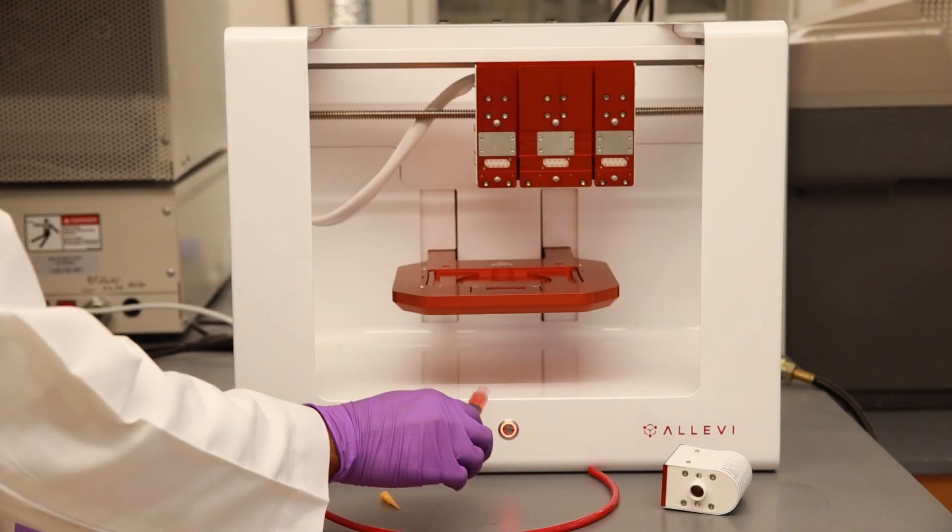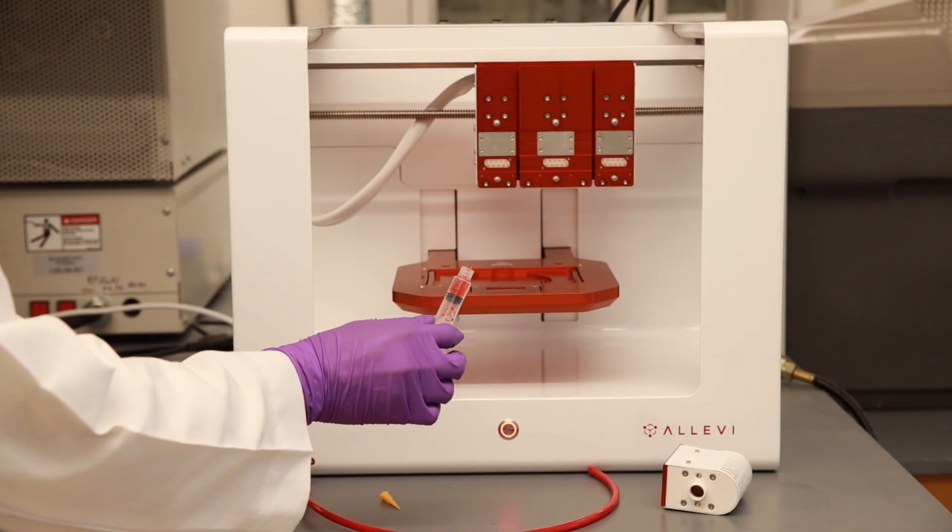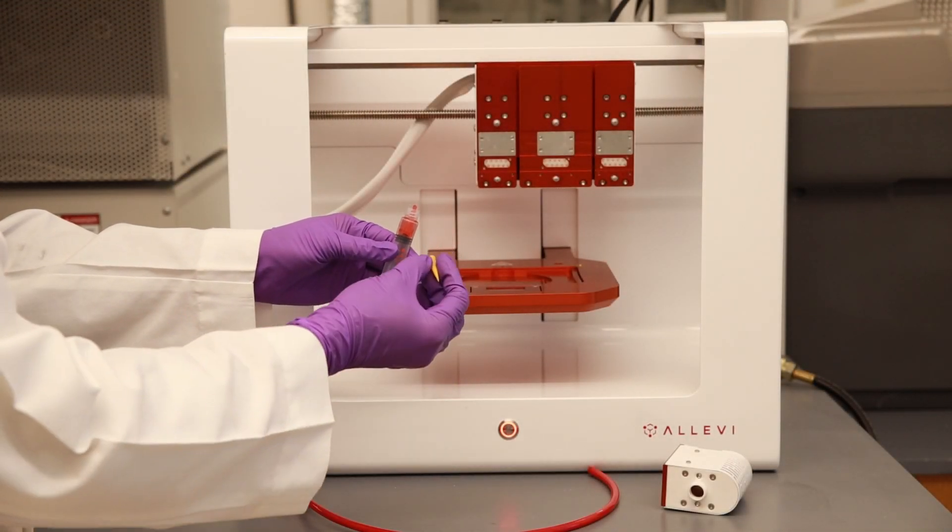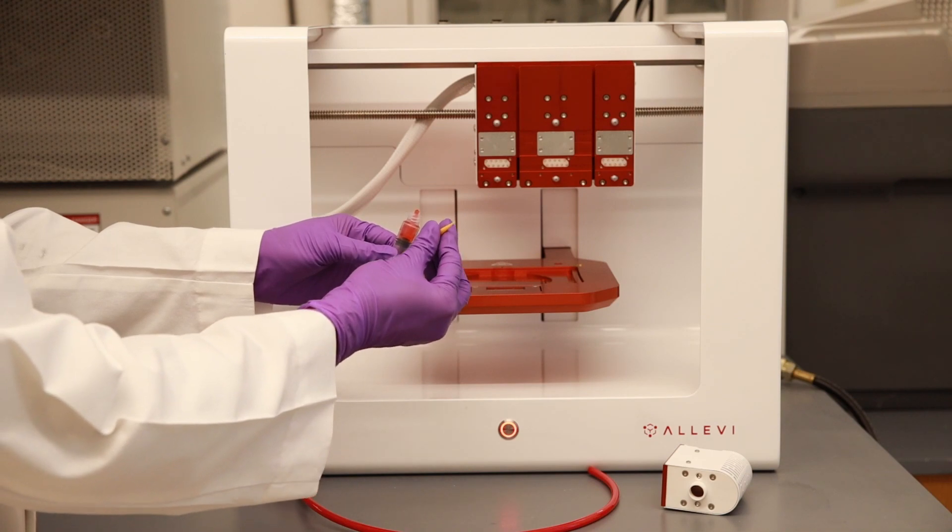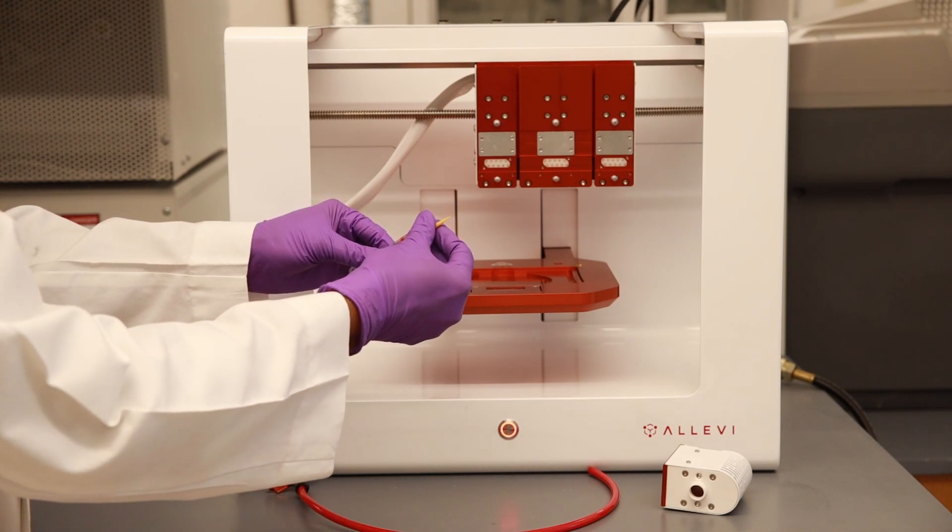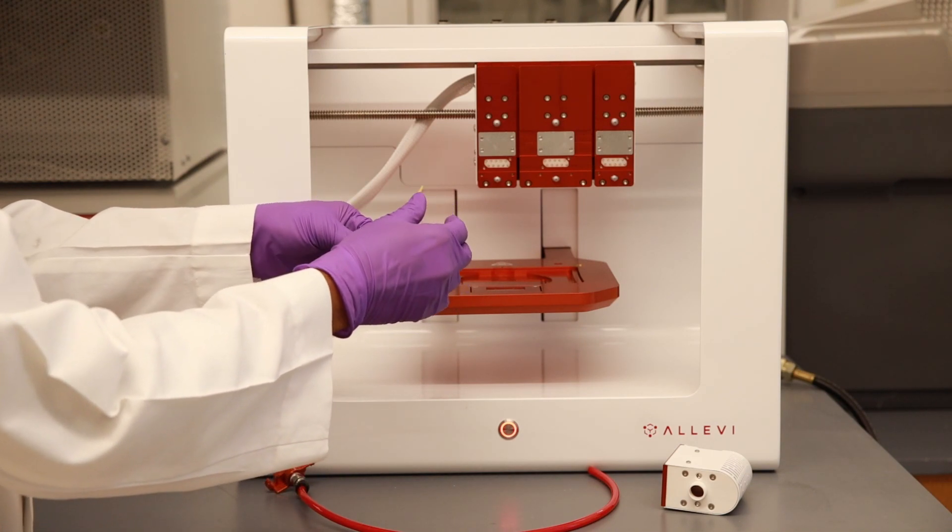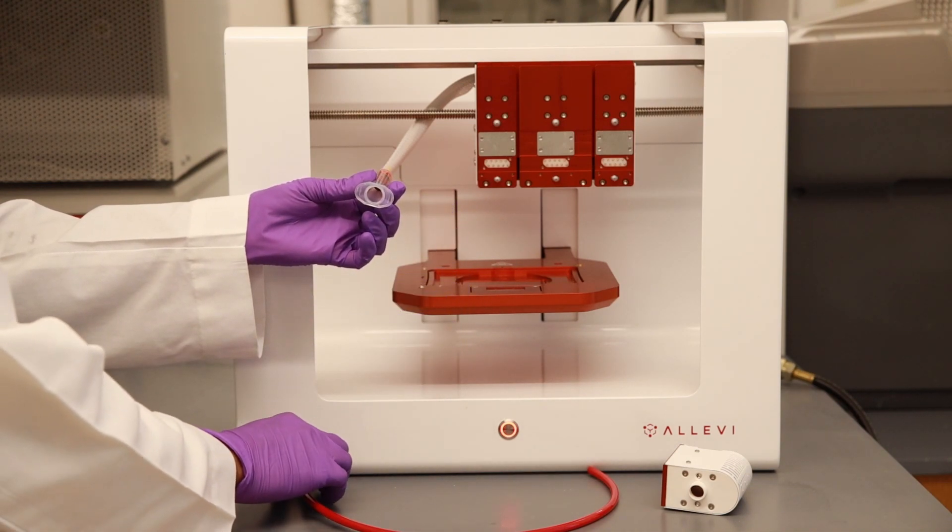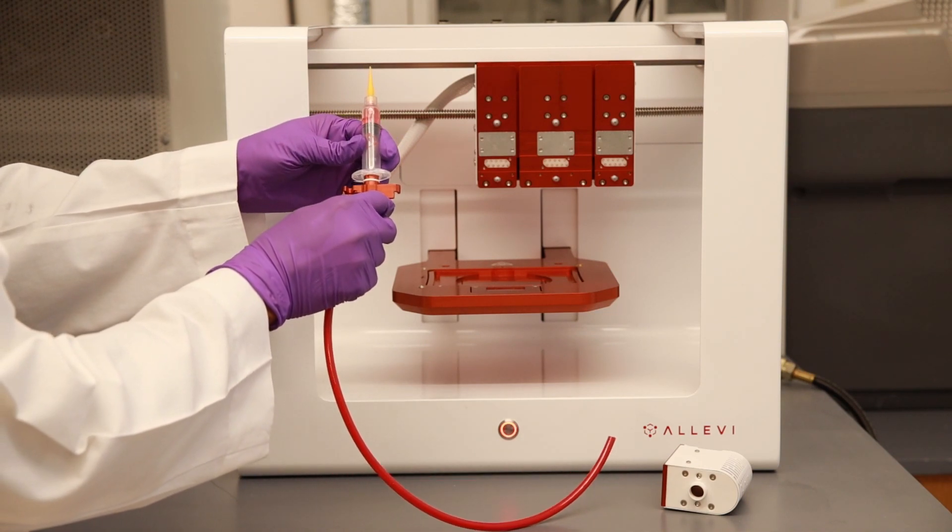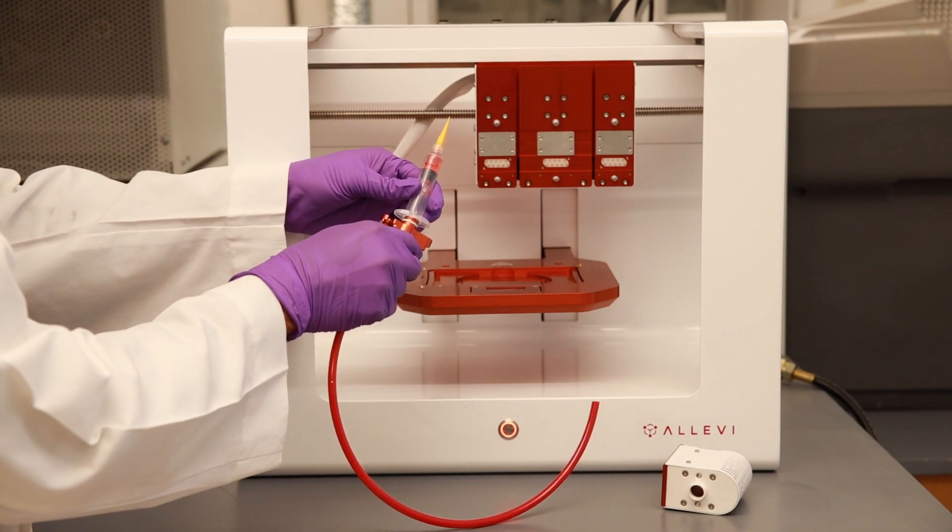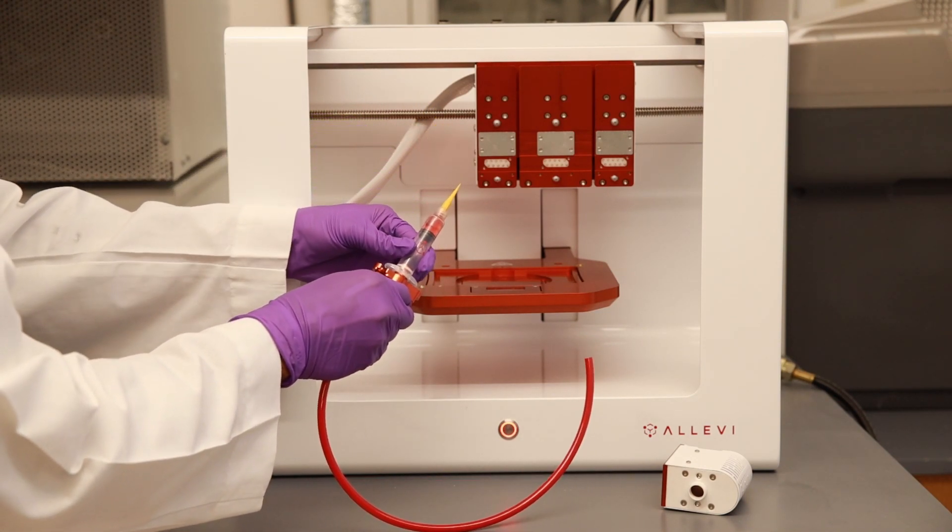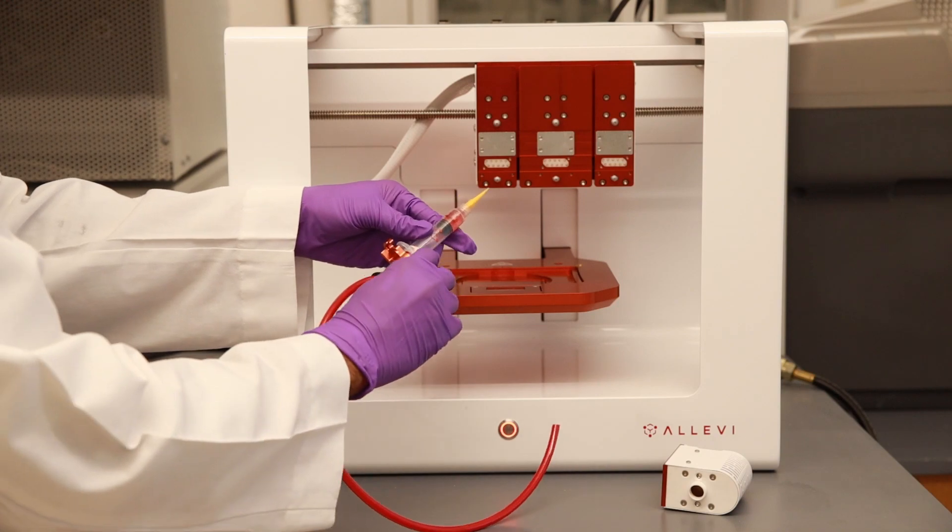Remove the female to female luer lock adapter on the Alevi syringe and attach the needle of desired size. On the other end of the Alevi syringe, insert the air compressor line adapter and push firmly.